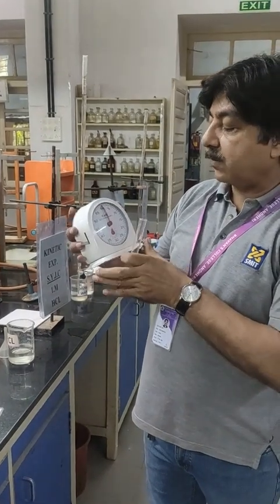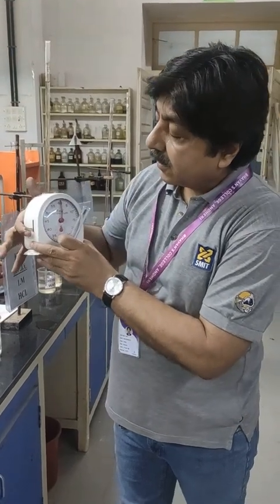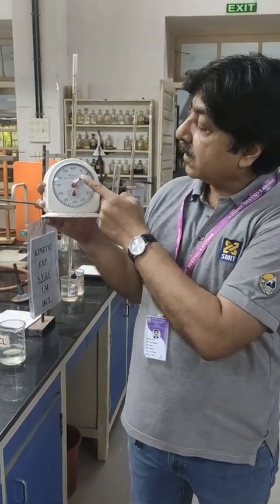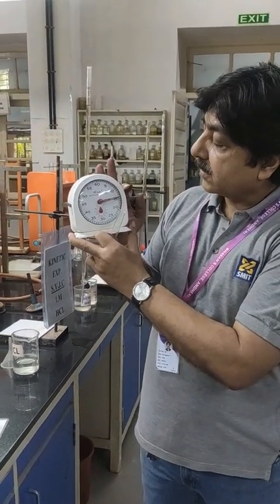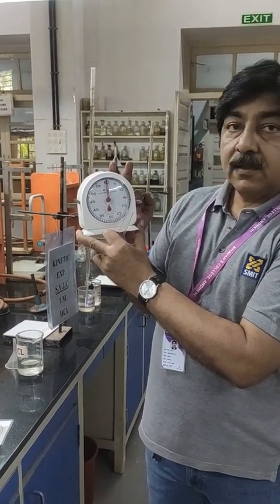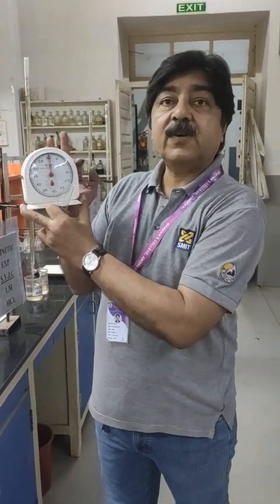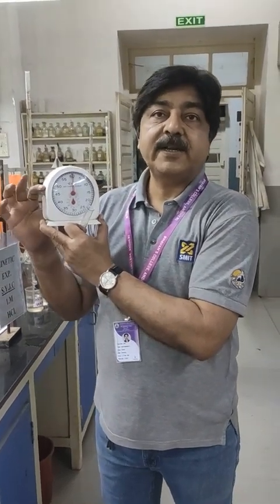This stopwatch has got two arms, one left arm and one right arm. With the help of this right side arm, I can set this clock into motion. You can see the arm of this clock is moving, and whenever I want to stop it, I will press this. It has gone to reset. So to avoid this mistake, always remember the left hand side arm is for resetting the clock. To start and to stop the clock, we will always use the right hand side arm.